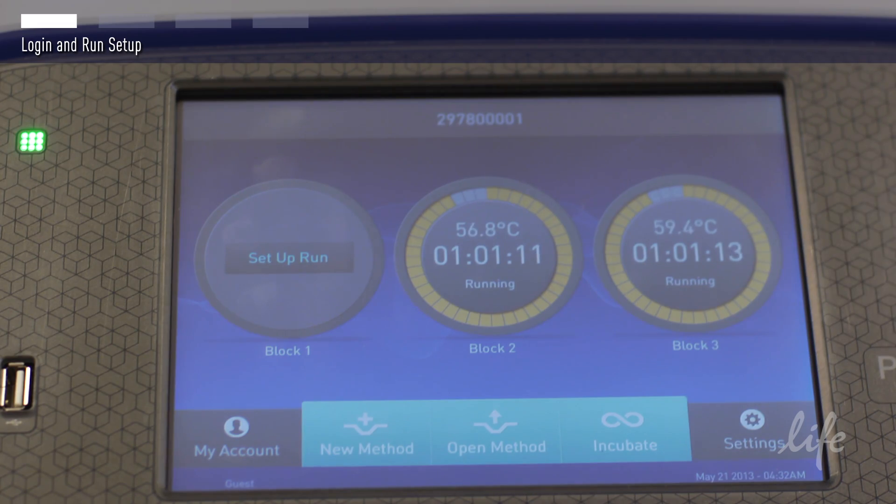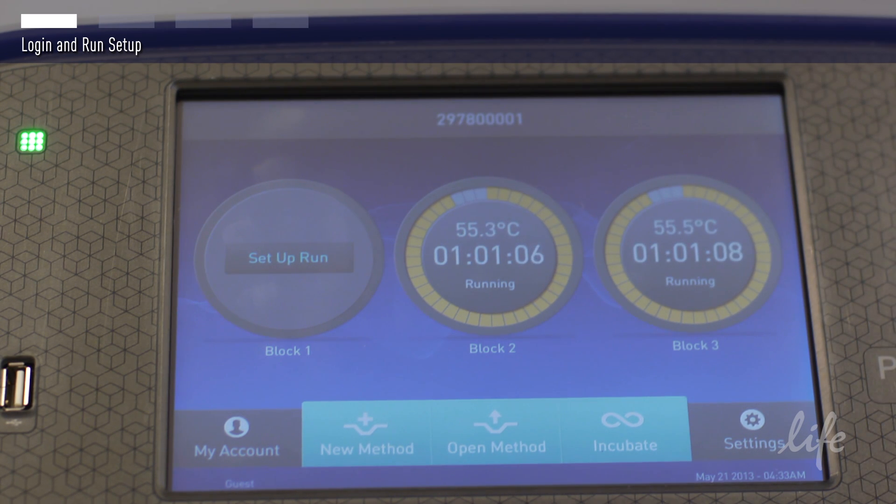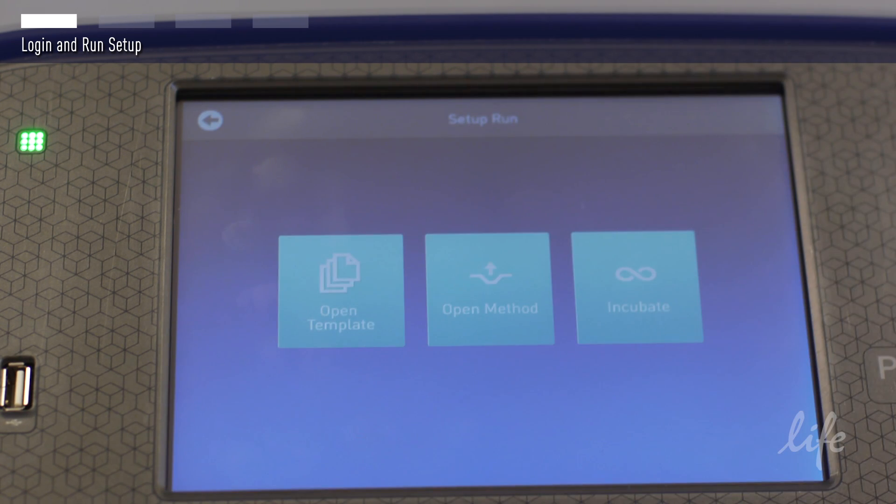The ProFlex shown comes with three independently controlled blocks. As you can see in this example, blocks two and three are currently in use. Select an open block to begin programming your run.